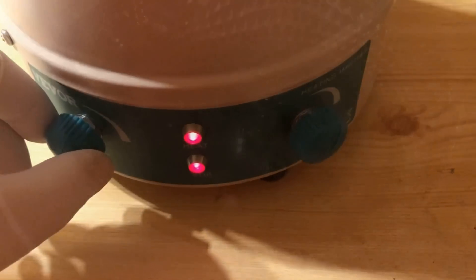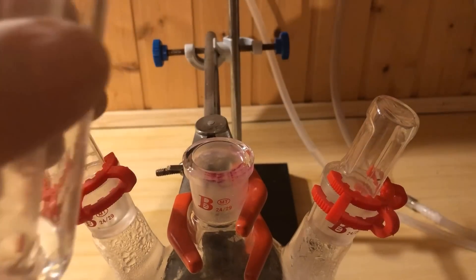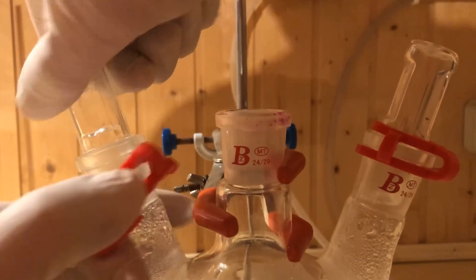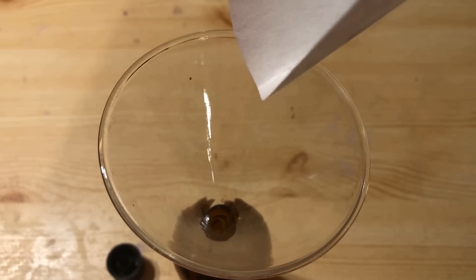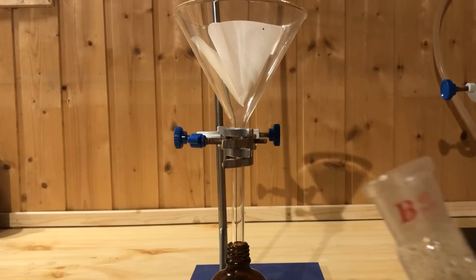After the 2 hours have elapsed and a clear solution has formed, allow the apparatus to cool before dismantling. 5 grams of fresh zinc powder is weighed out and transferred via a funnel into an amber glass bottle. Then the solution is filtered directly into the bottle.